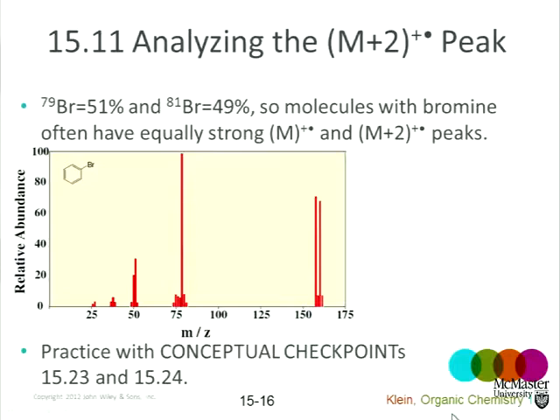But in fact, we're learning a bit more detailed stuff here. You don't have to memorize all of the details here. The key point is that mass spectrometry gives us the molecular weight, but what we want you to recognize is that in fact the information content is a lot higher. You can tell how many carbons there are in that molecular ion. You can tell whether it's got chlorine in it, whether it's got bromine in it, and so on and so forth.